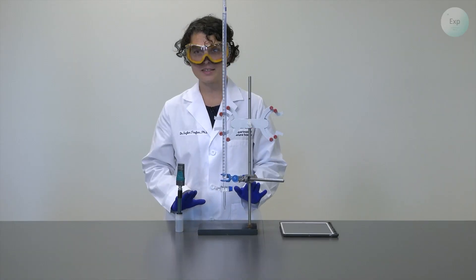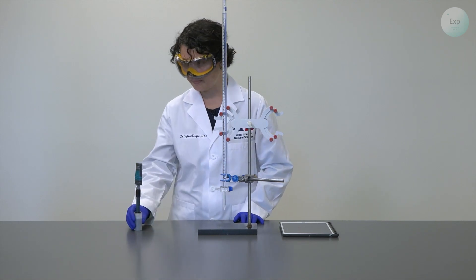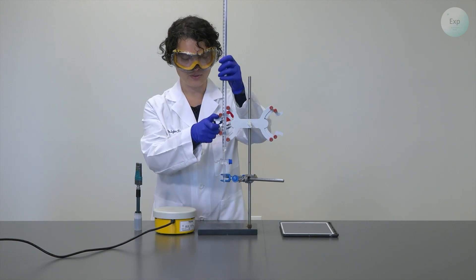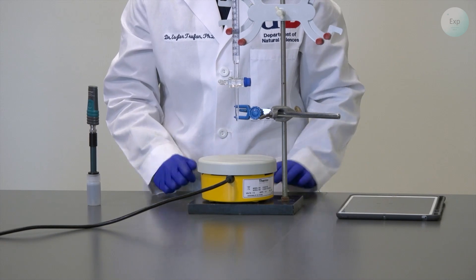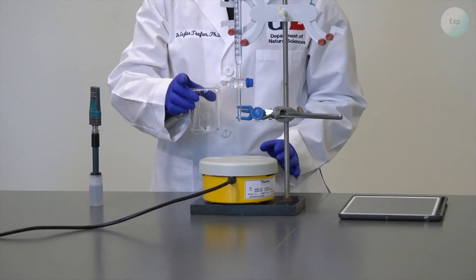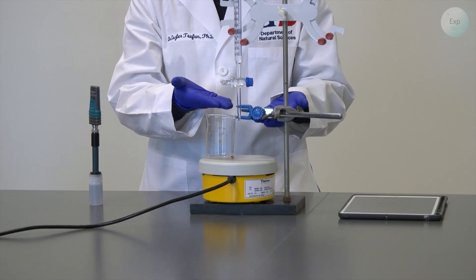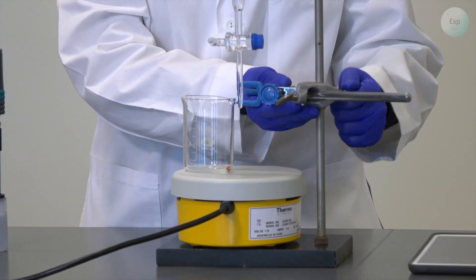Because we want consistent stirring throughout the process, we're going to use magnetic stirring today. I will need to raise my burette so I can slide the stir plate under it, and I will need a 150 milliliter beaker with a magnetic stir bar in it. If any of my connections are below the rim of the beaker, I need to raise them.